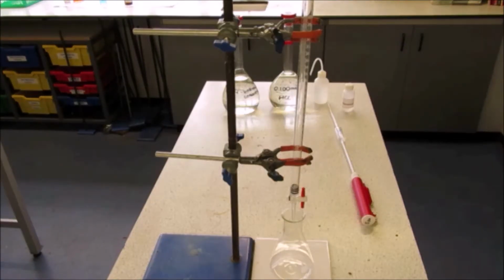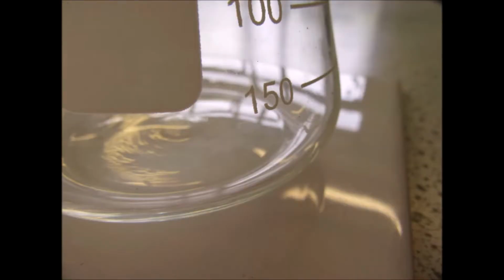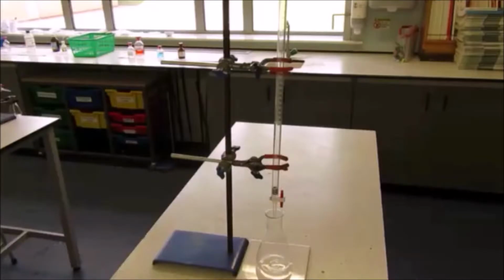Your equipment should look like this. Be prepared to write this down. Notice, the burette has been positioned upright and leads into the conical flask. The conical flask itself has been placed on the white tile to allow noticeable colour changes, and the tap of the burette has been positioned to close to prevent excess acid leakage. Ensure your equipment is set up as shown in the diagram.